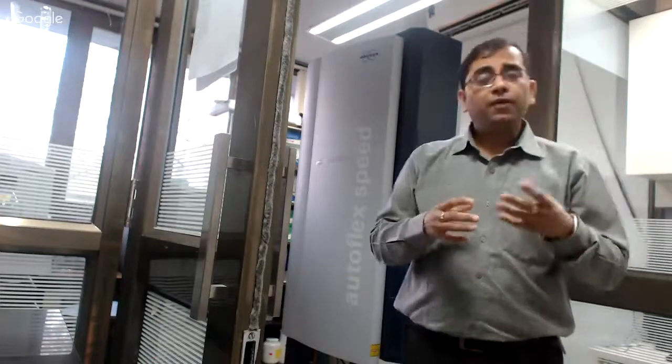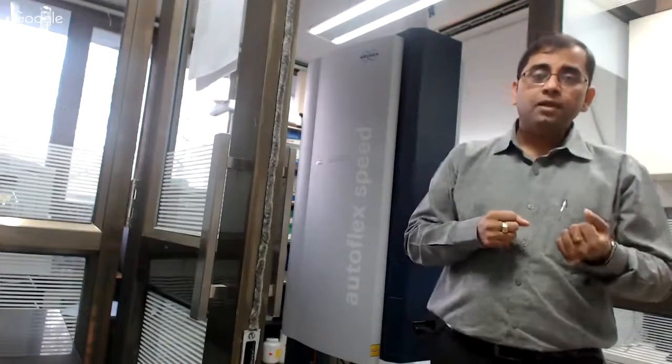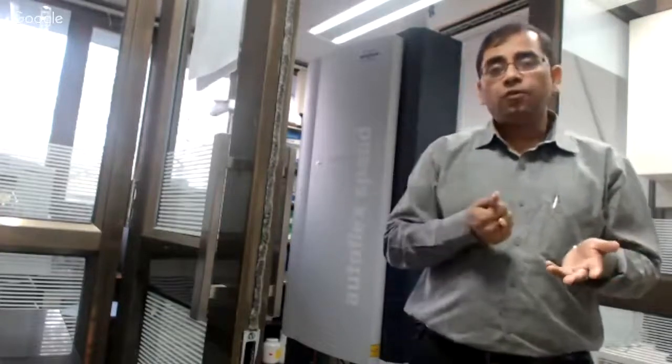For example, different types of mass spec configurations all have some value added information which you can obtain. In this case, I prefer Maldi for some very quick analysis. If I want to just know the mass of a given compound, say we have purified a protein and I just want to know the molecular weight of the purified protein. Is it matching my known or expected molecular mass? If that is the case, then probably I'm very happy that this is right. I don't need to do anything else from any other sophisticated mass spec instruments. Maldi TOF can do that part.